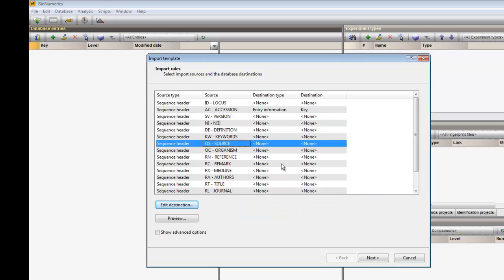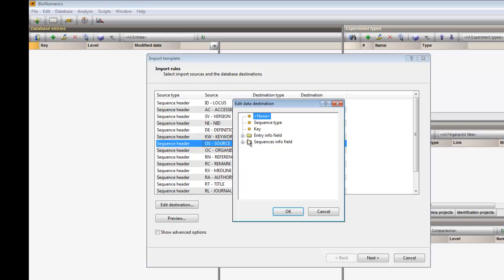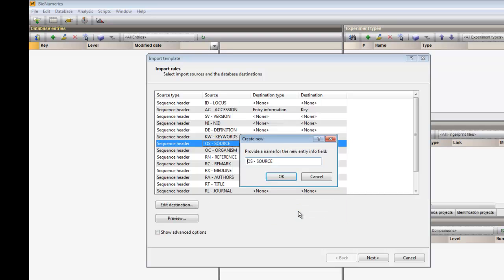Further, I would like to write the content of the source field to a new Bionumerics database information field. I can edit the name for a new Entry Info field or leave it as proposed.